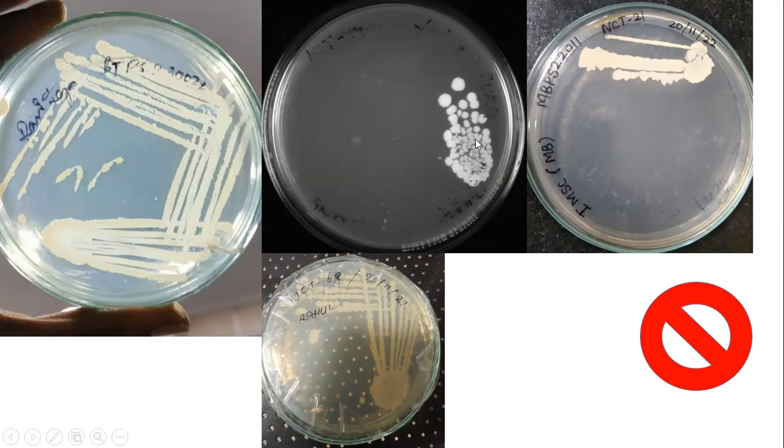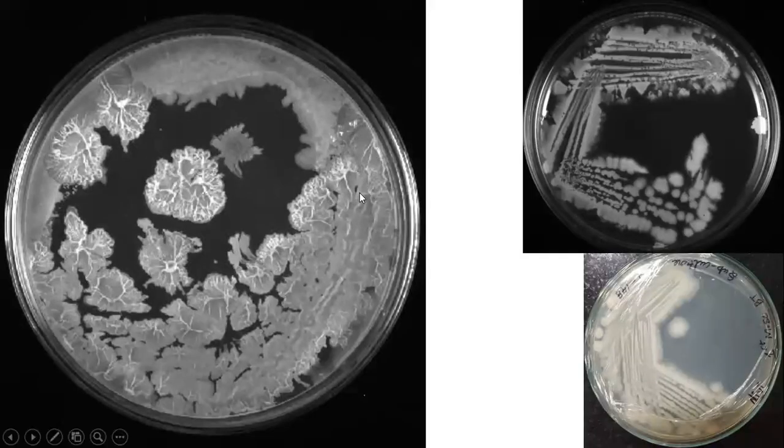So this is how you are supposed to get an isolated colony, but there are some bacteria, for example, Bacillus megaterium. This is a quadrant streaking. The candidate did not make any mistakes here. But what has happened is Bacillus megaterium sometimes has a swarming motility in the plate in search of nutrients. You cannot stop them. They will just produce excessive EPS or polysaccharides, and they will fill the plate. It is very hard to get isolated colonies.